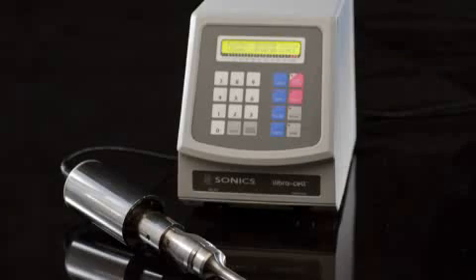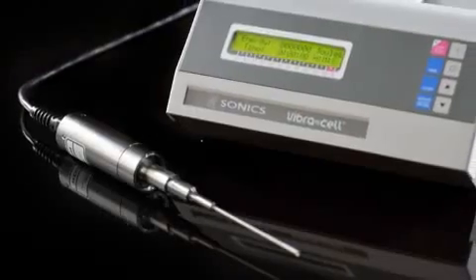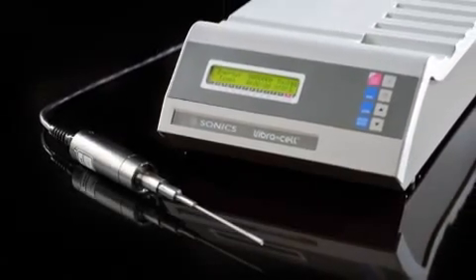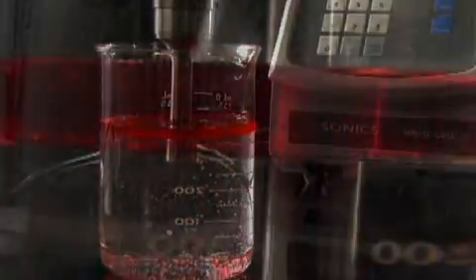The VibraCell product safely processes a wide range of organic and inorganic materials in a broad range of application settings, including nanotechnology, liquid dispersion, cell lysing, homogenizing, particle size reduction, chip assay, and disaggregation.